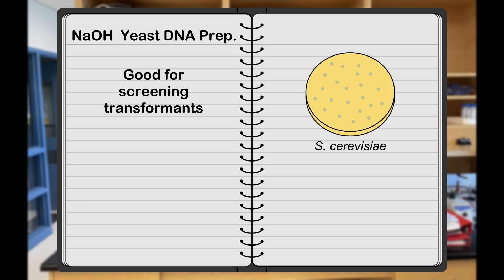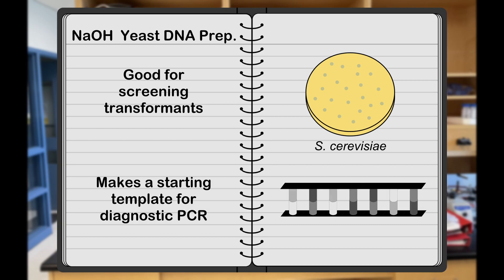This prep is good for screening transformed cells and makes a starting template for diagnostic polymerase chain reactions.